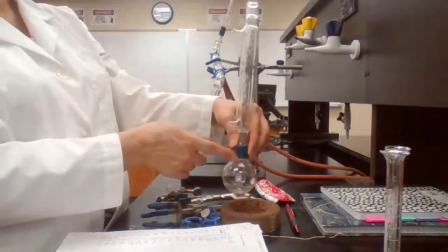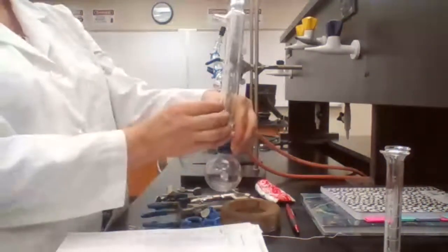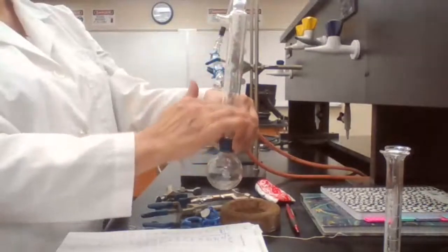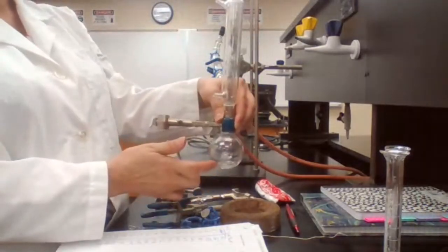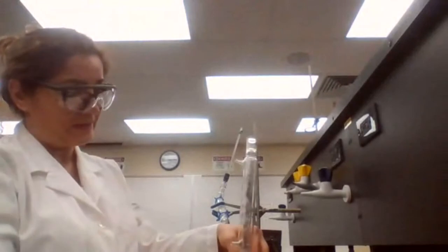The vapor, as it comes up, is going to lose heat. So this column is going to start getting warm and gradually is going to get warmer. So now we have a mixture of A and B. A has a lower boiling point and B has a higher boiling point.